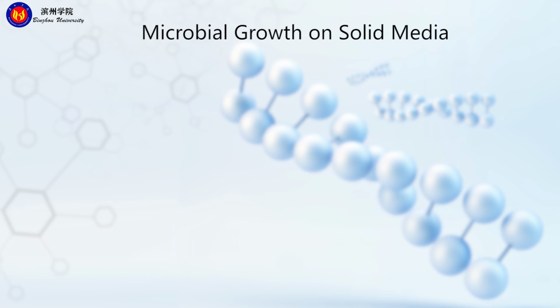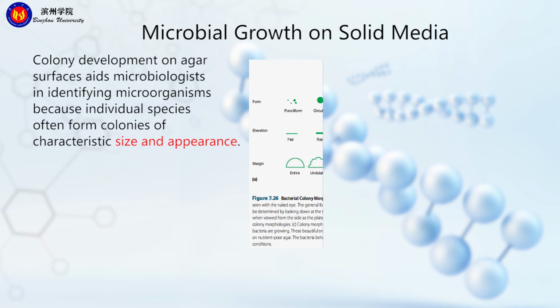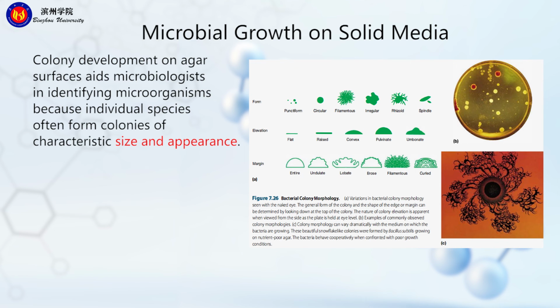At last, let's see the microbial growth on solid media. Colony development on agar surfaces aids microbiologists in identifying microorganisms because individual species often form colonies of characteristic size and appearance. You can see it on the picture in the middle. The colonies have different morphologies.